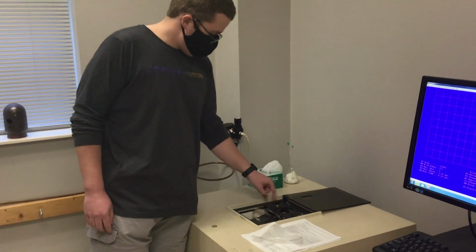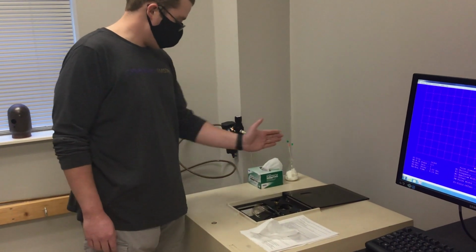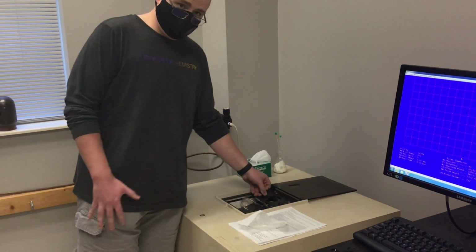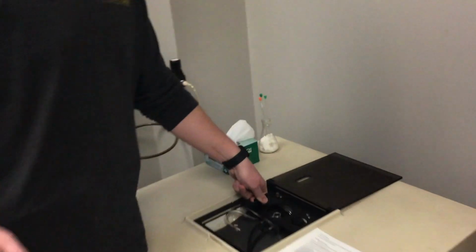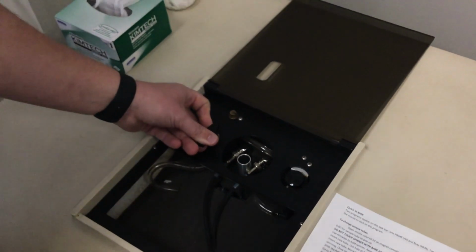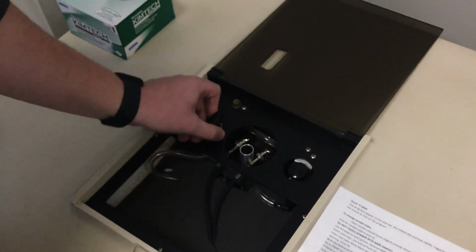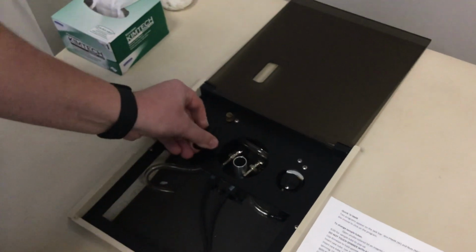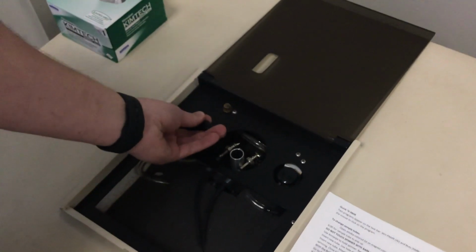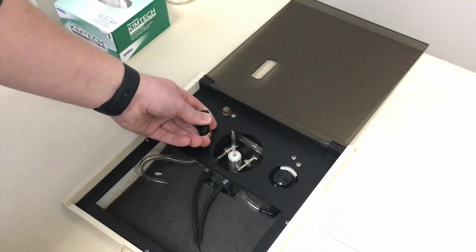This is the component that controls the air pressure on the inside. Right now, the arrow is pointing, if you were standing in front of the NMR, at 12 o'clock. And if you're close enough, you'll hear it when you're here in person. I don't know if you can hear it through the iPad, but it's hissing a little bit. That's air on the inside that's causing the spindle to spin. So to stop it spinning, I turn it to the 3 o'clock and let it stop. And then once that's done, I slowly turn it to the 6 o'clock, and that will send air up through the chute to carry the spindle to the top.